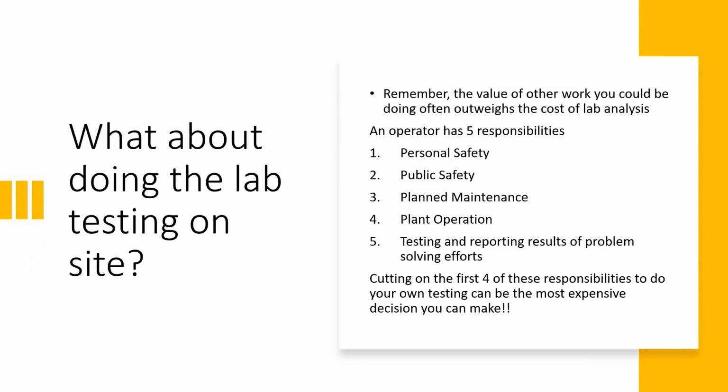But they can't afford equipment for an occasional test, that requires some very specific types of equipment and capabilities to do the test. And they don't have the time for it. And here's the important point now: you have about roughly 5 responsibilities in coming to work and solving a lab problem.